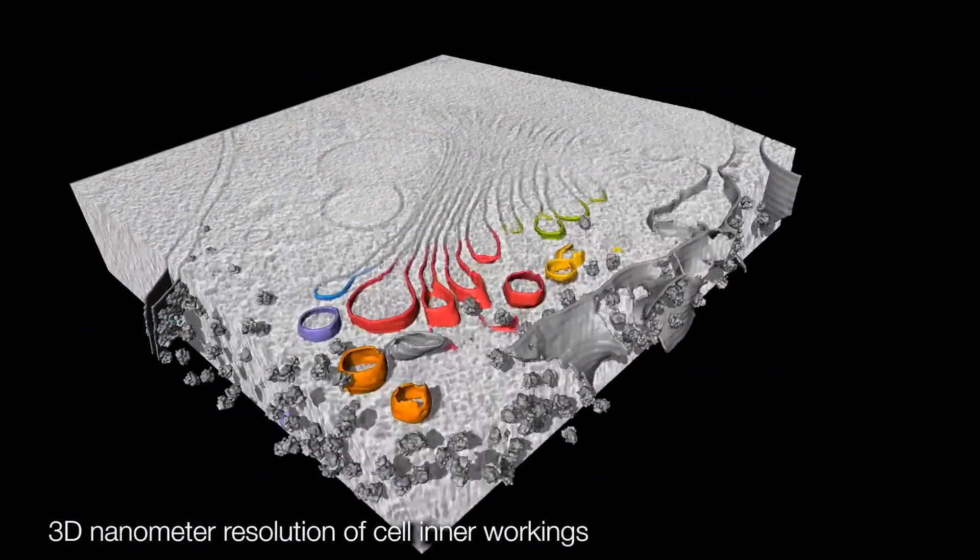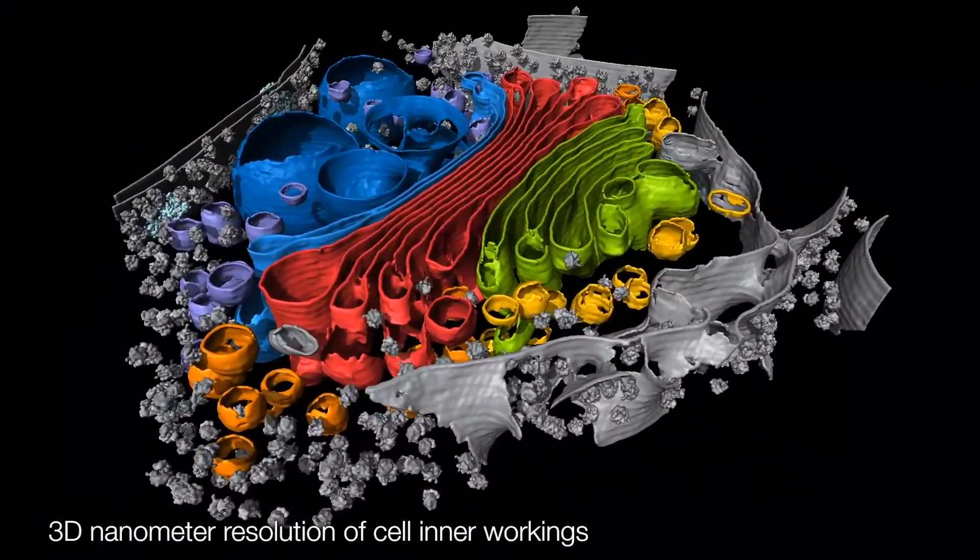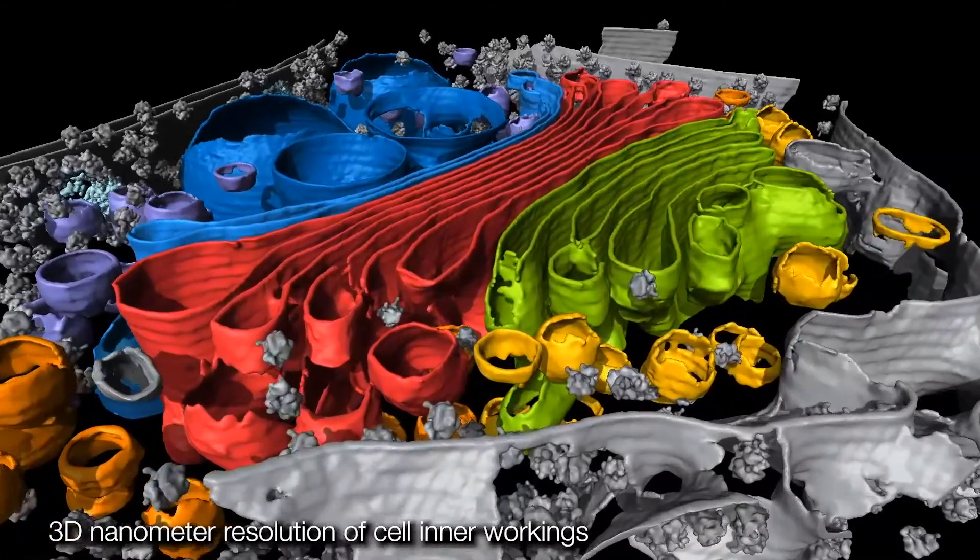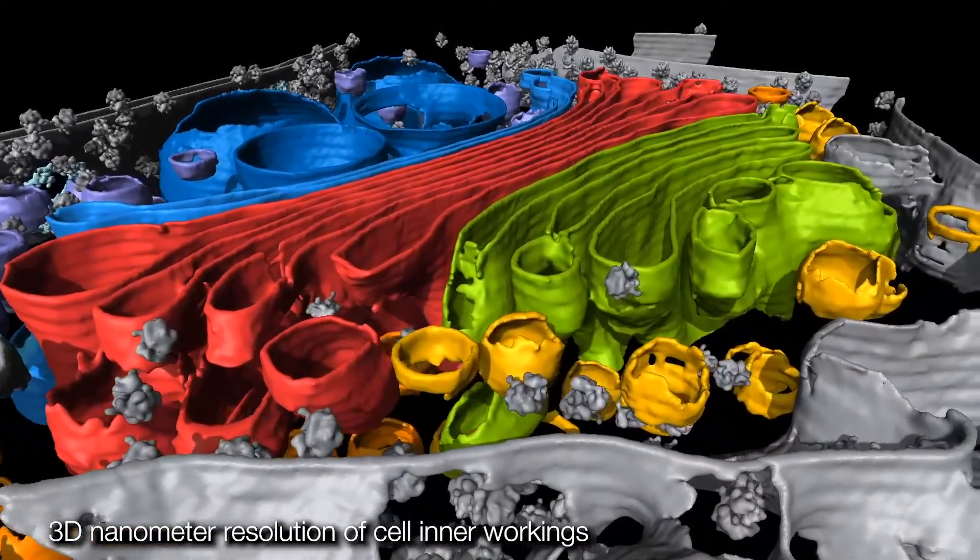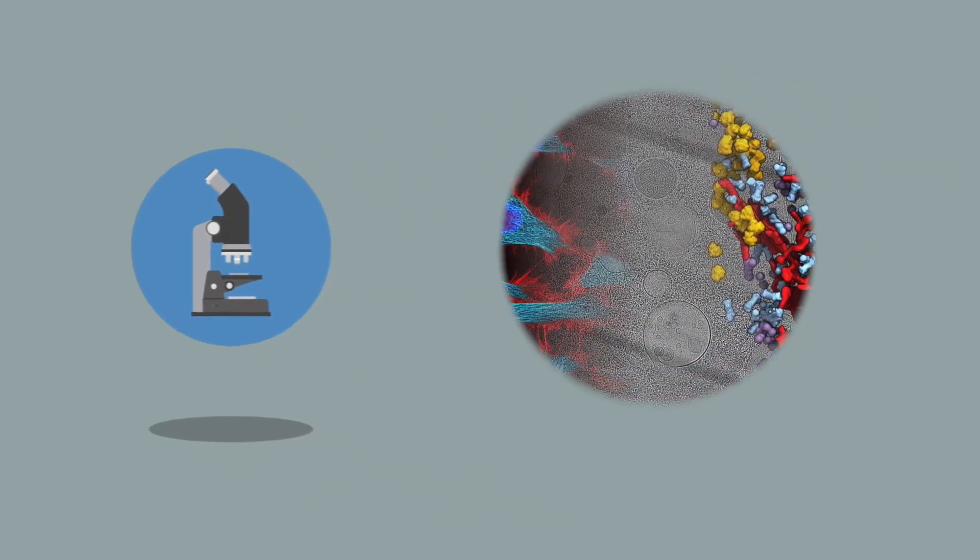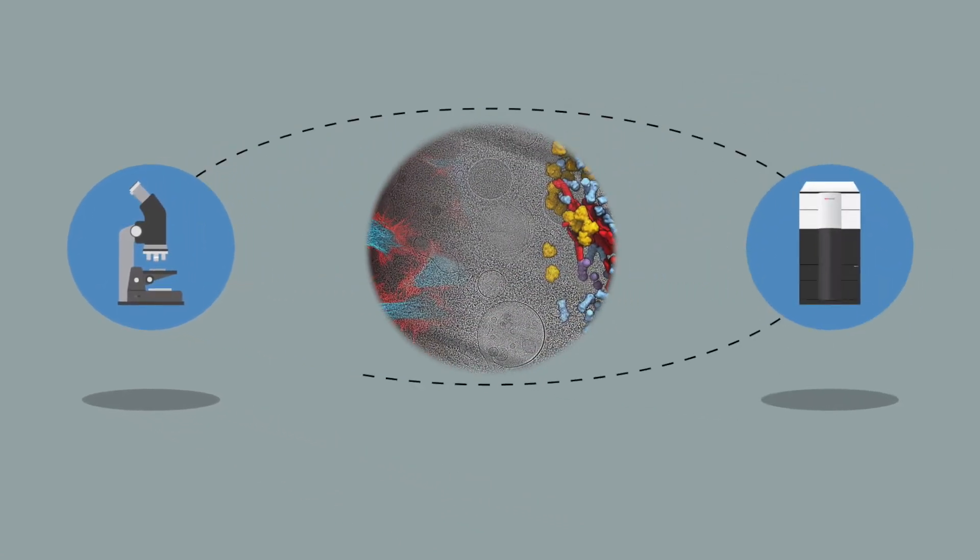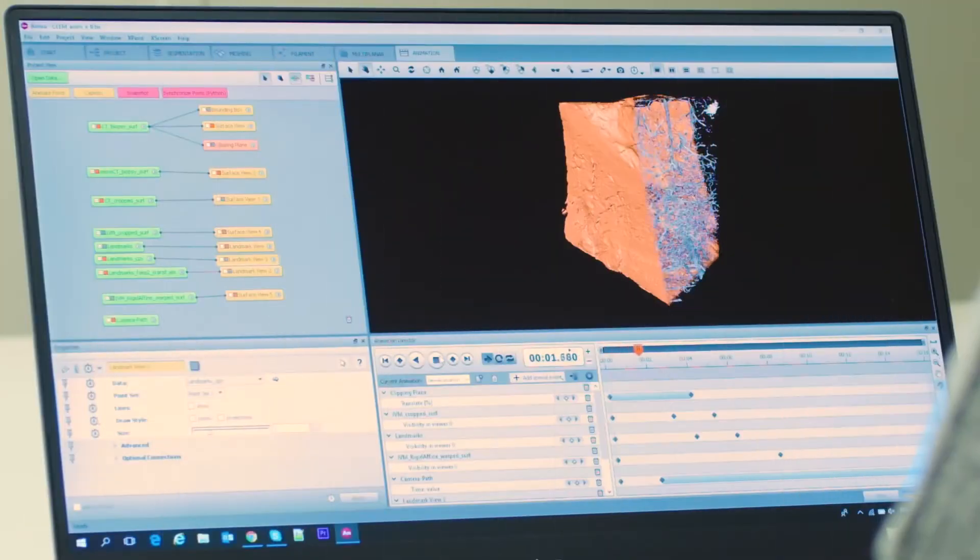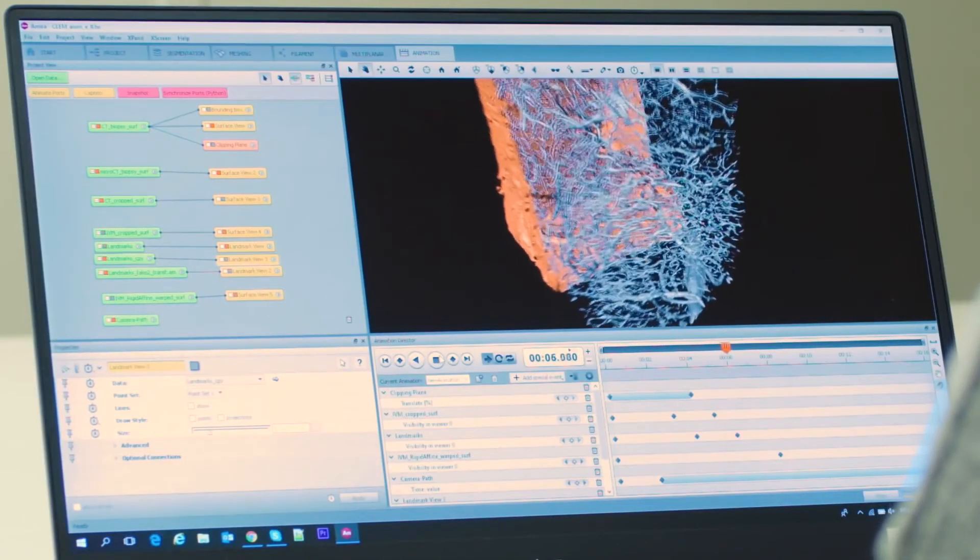We can do this because cryotomography delivers both the structural information about individual proteins and their spatial arrangements within the cell. This truly unique method bridges the gap between light microscopy and near-atomic resolution techniques, such as single particle analysis. In doing so, cryo-tomography holds enormous potential for cell biology.